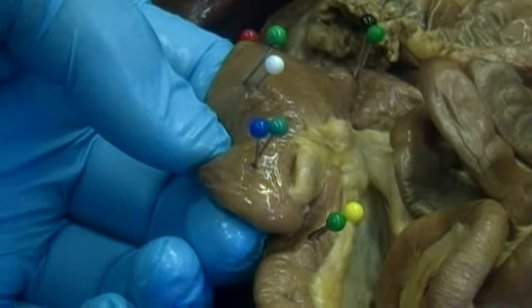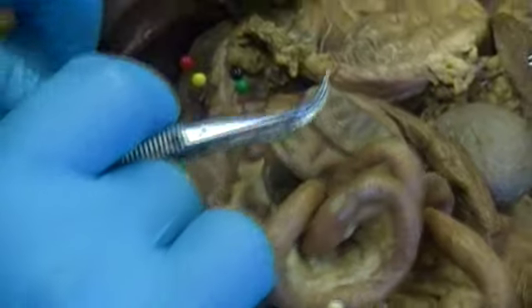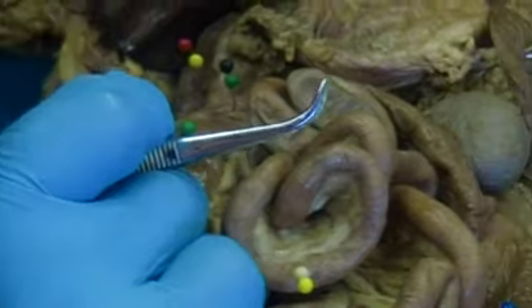The cat doesn't have an appendix, but it does have epiploic appendages. This particular epiploic appendage is very close to where the appendix would be in a human, so if it were pinned I would expect you to identify it as the appendix. Moving upwards, we have this portion of the large intestine going up — the ascending colon, labeled with the green and white pin.